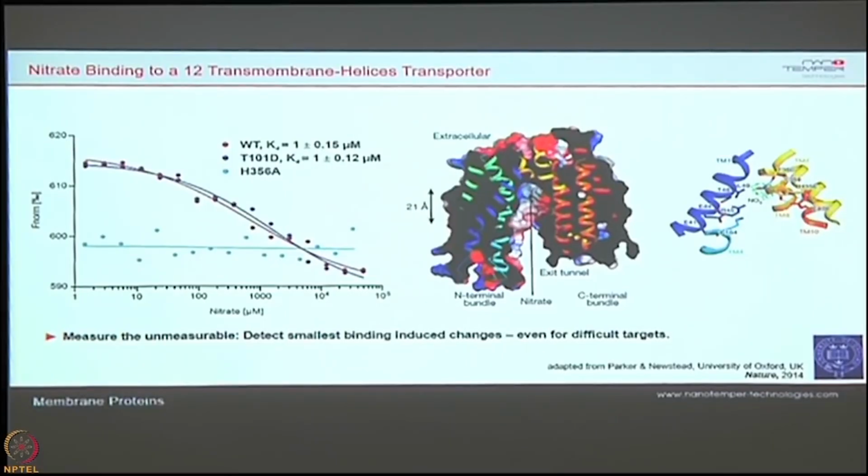Suppose I have an SDS, or some foaming agents in the sample, then obviously you get a lot of artifacts. Here in this technique, as I said, we are using only 3 to 4 microliters of the sample, so that can be nullified. So even membrane proteins can successfully be studied here.